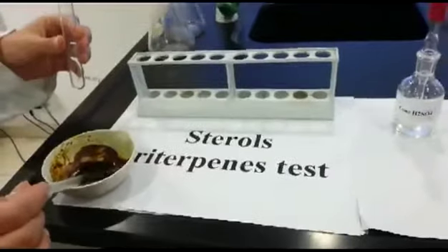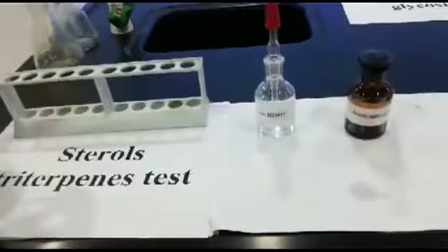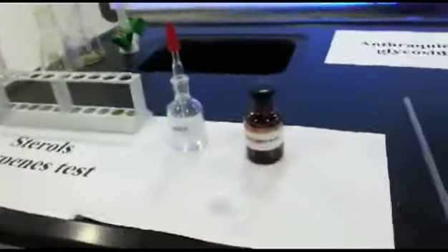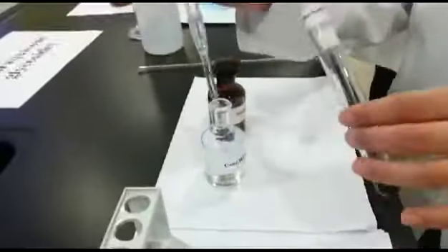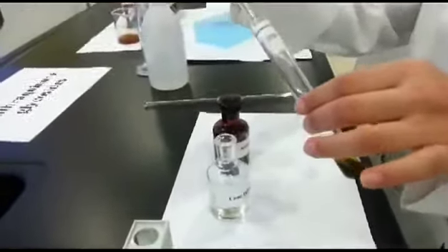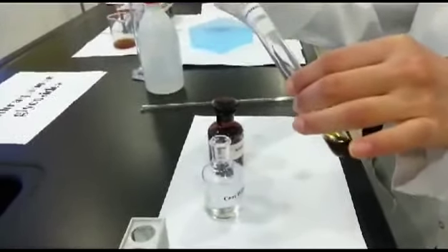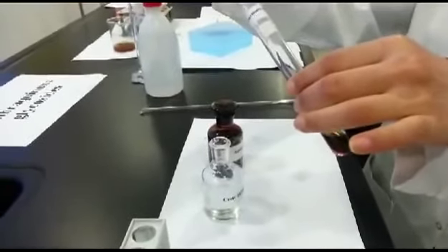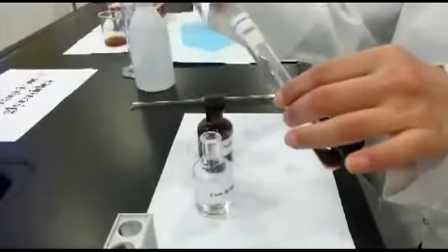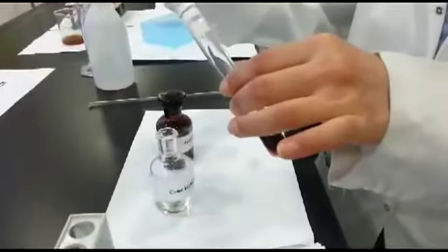Sterols and triterpenes: add 2 ml of alcoholic extract plus 2 drops of acetic anhydride plus concentrated H2SO4 added on the walls of the test tube. Through the walls, a reddish color ring means a positive test.